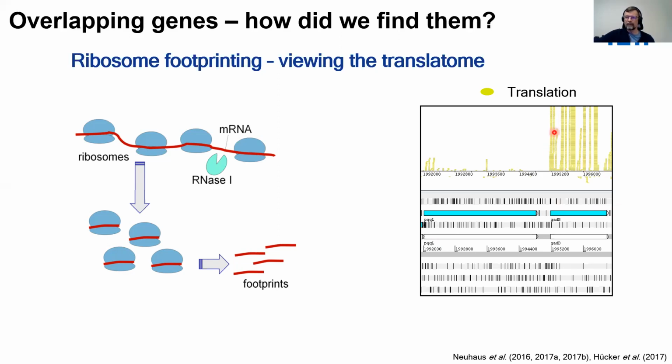That you have these gaps and valleys and hills, this is due to the technique, it's not perfect, it's not covering everything, and actually, to be very honest, we don't know why you sometimes get stacks of reads like this one here, and sometimes you don't get any read at all.